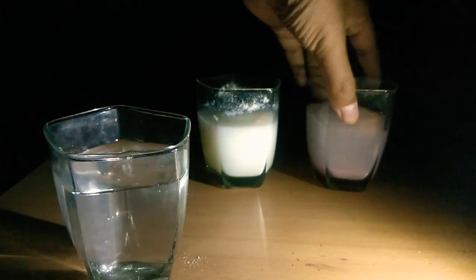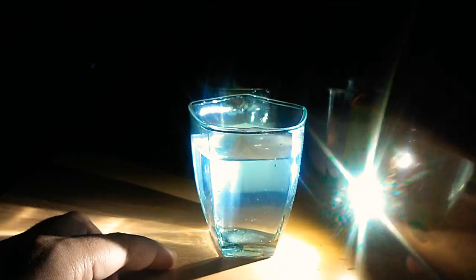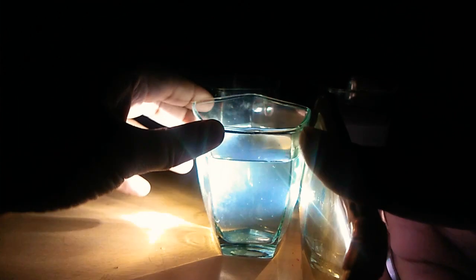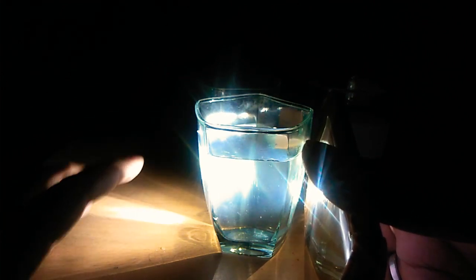So this was your solution. If I bring this light here, you cannot see any ray of light passing through the glass. It is absolutely clear, and generally solutions do not cause scattering of light.